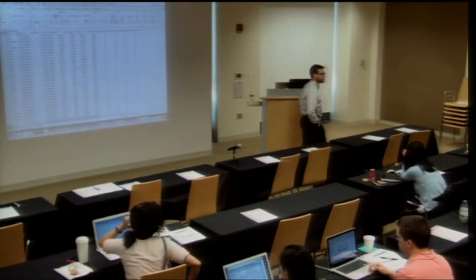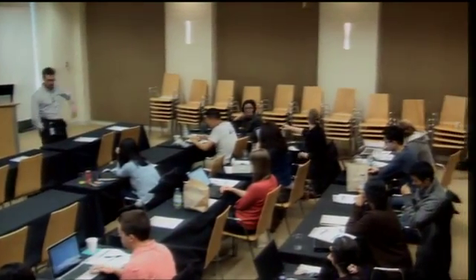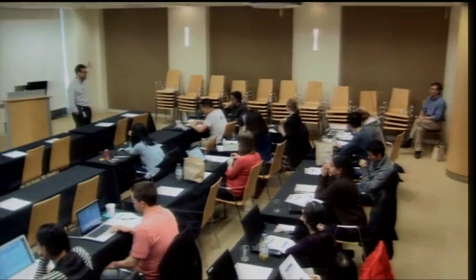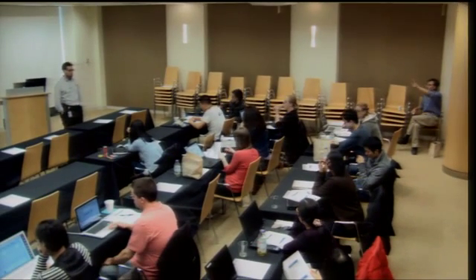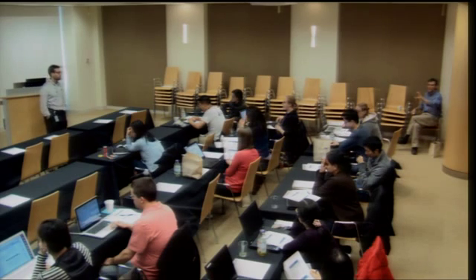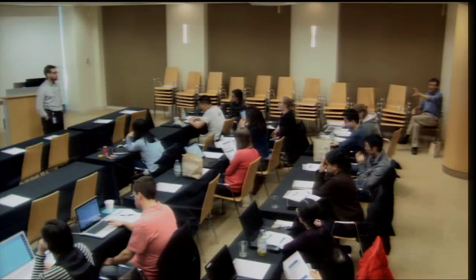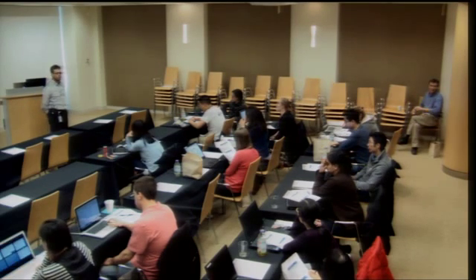Dave, do you want to comment further on that? Yeah, are there any thresholds baked into this analysis? And there aren't. As John said, it gives you a continuous list for every gene, but we would assume that only the top of the list is actually going to have any power and be meaningful. But it gives you a ranking for everything.